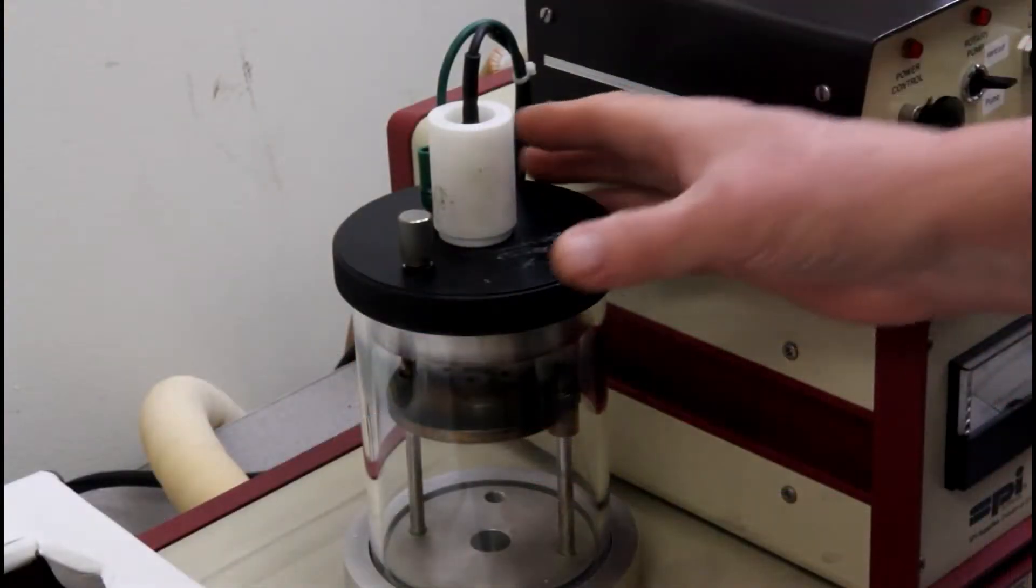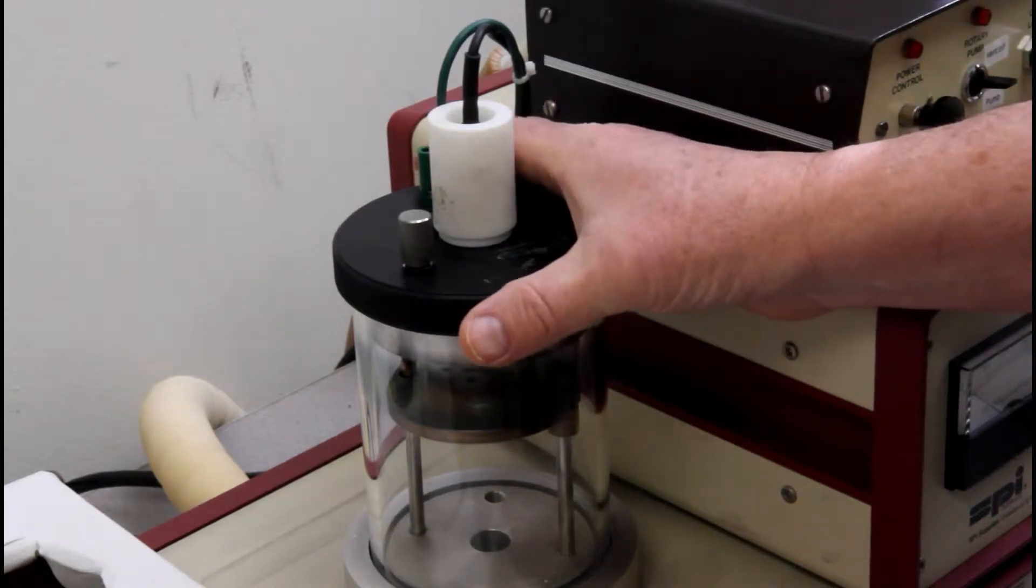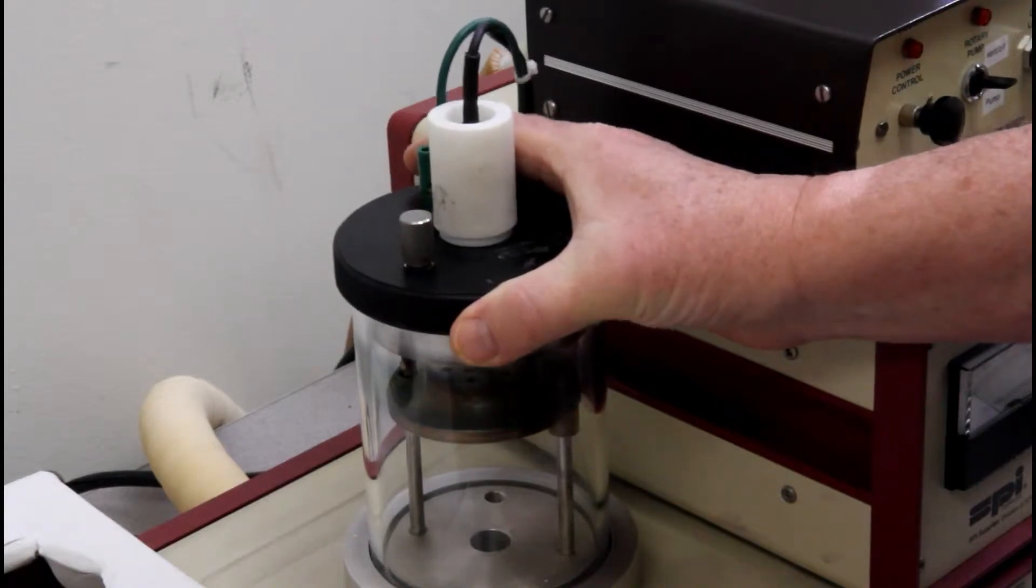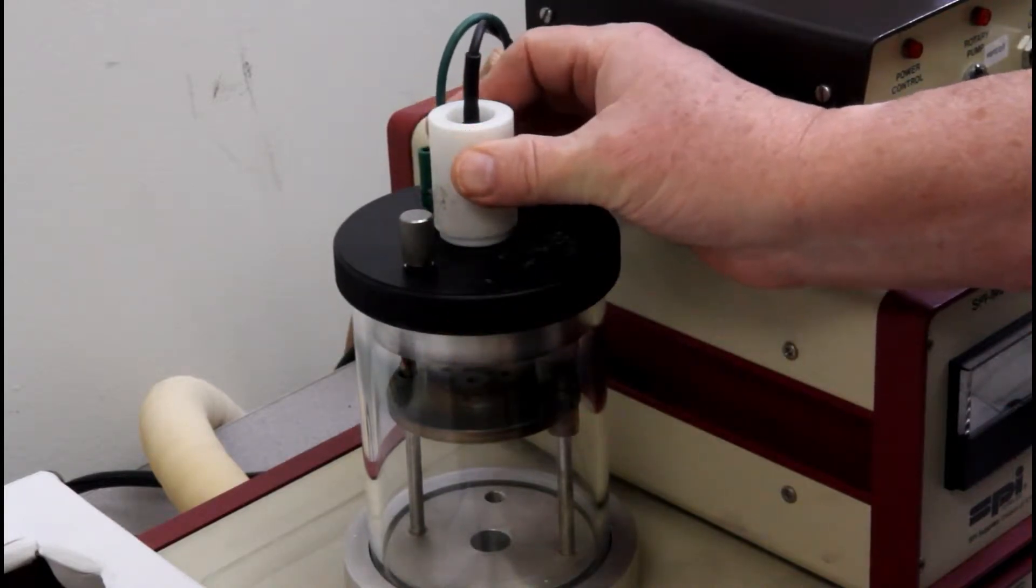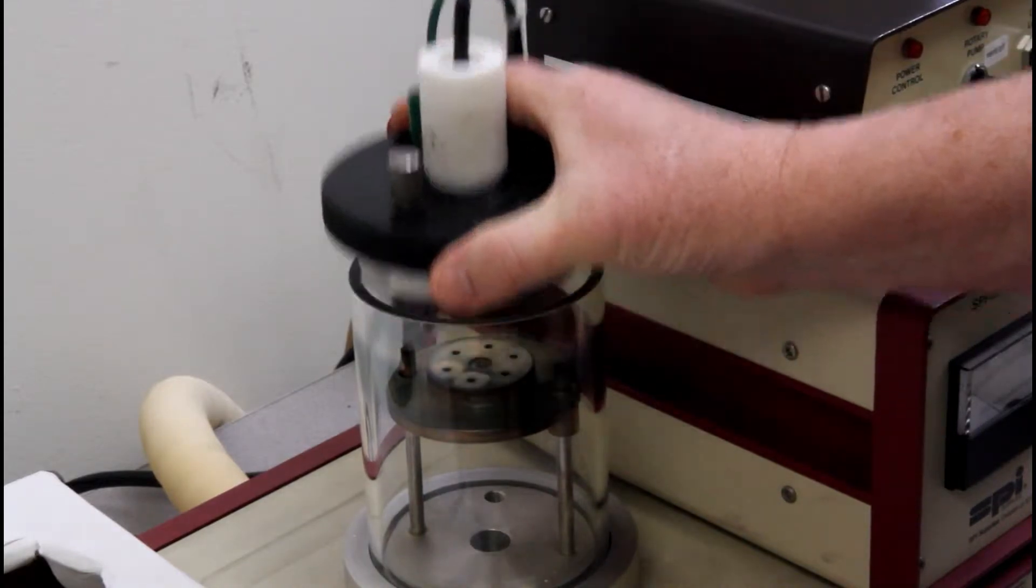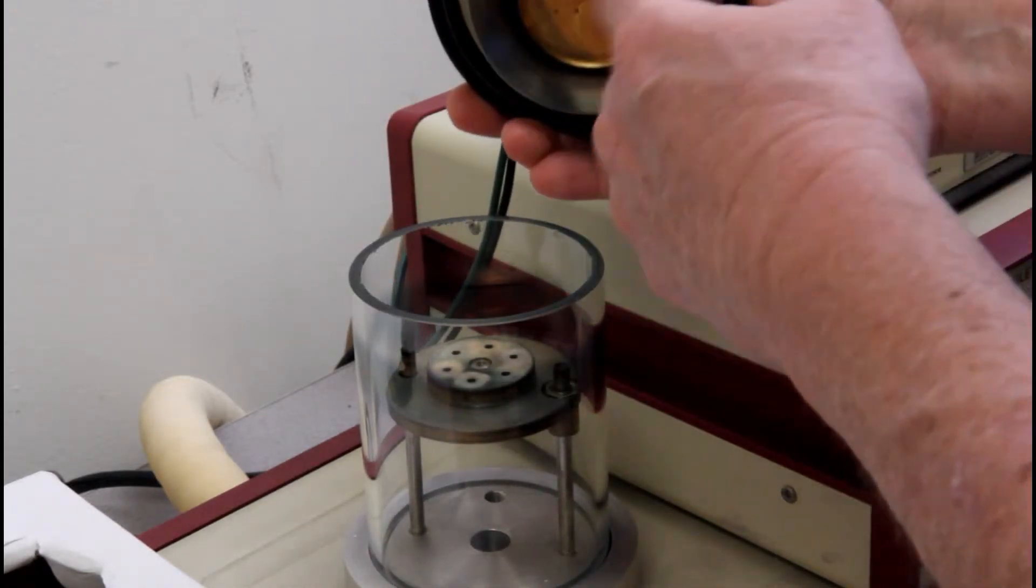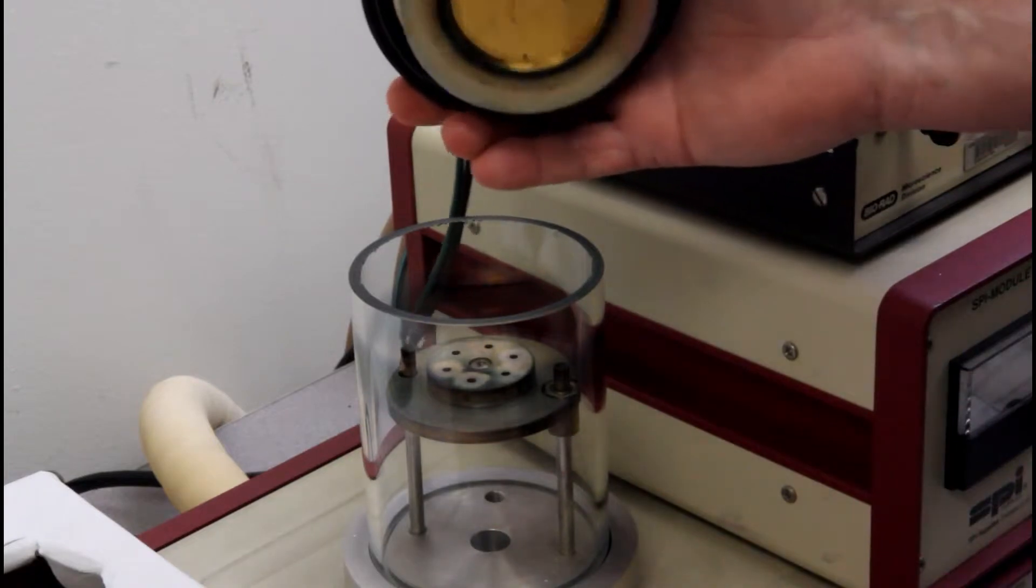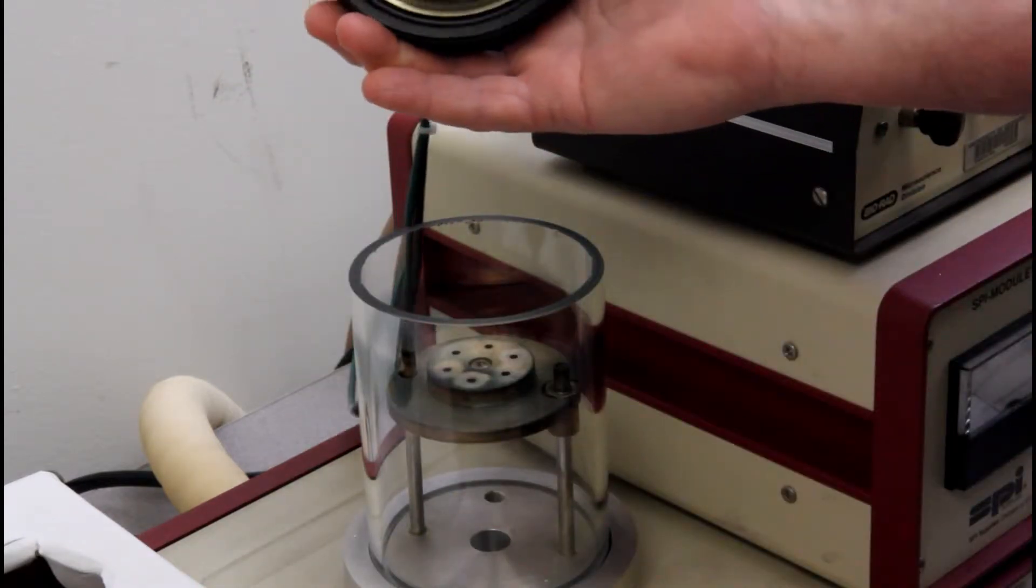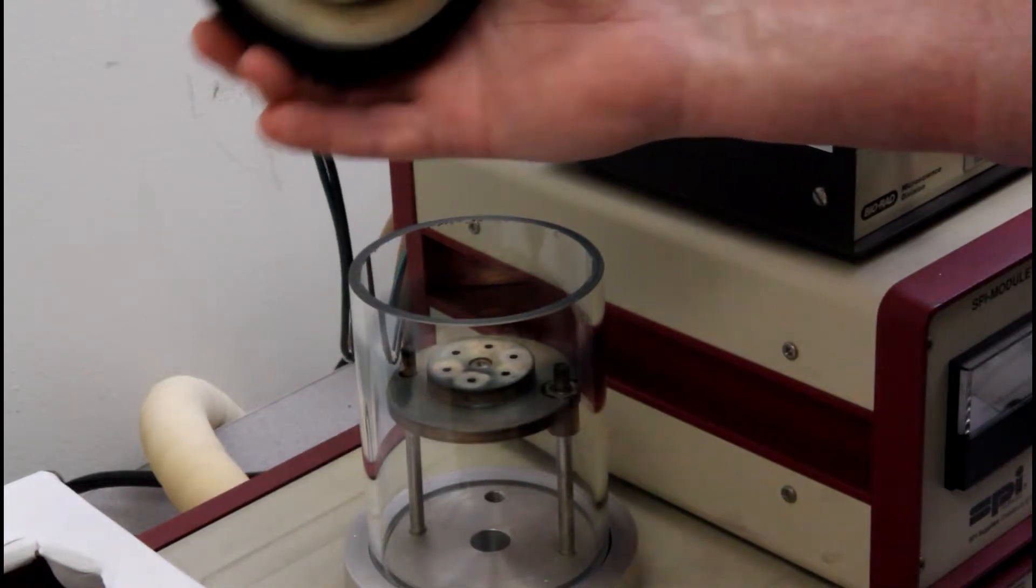When putting the sample into the sputter coater, you'll lift the head and you'll hold it like this. Do not pick it up by this. These will come off, they're just merely plugged in to the surface. So you'll lift this up and underneath you can see the target, the gold target. There's also an O-ring around the outside. You just want to quickly inspect it to make sure that there's no debris.